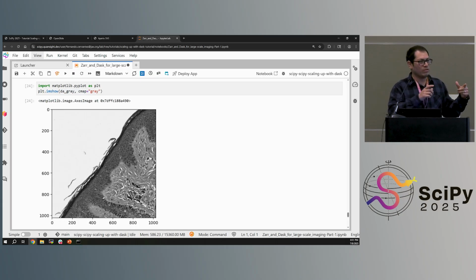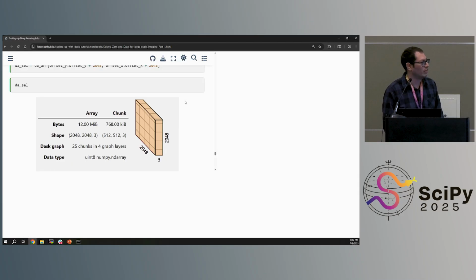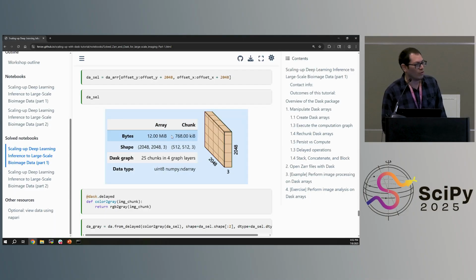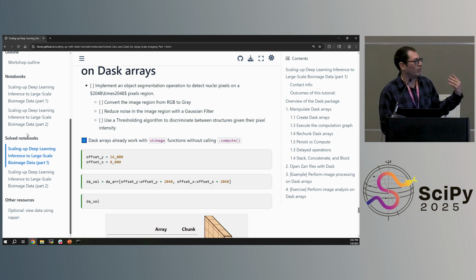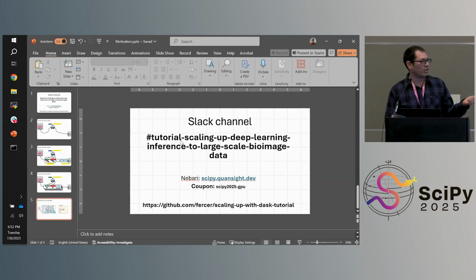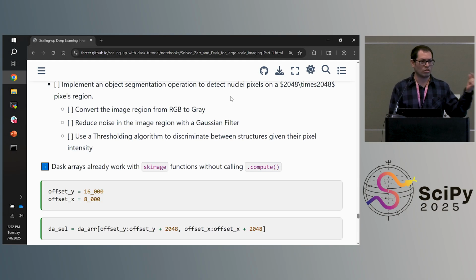And the next level is going to have a downsampled version of that. And the next level is going to be an even more downsampled version. That is mostly used for visualization purposes. So if we want to operate on the full resolution image, you will access component 0, that is the top level. And this is what I was telling you. If you load this into memory, it's going to be a 4 gigabyte array. But it is just loading these 192 kilobyte chunks at a time.